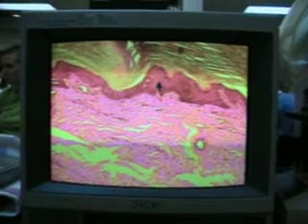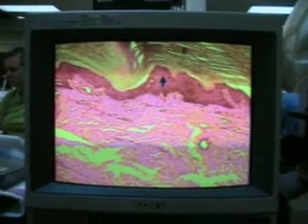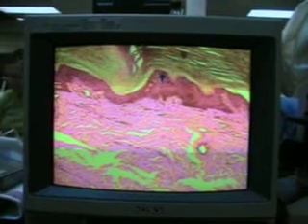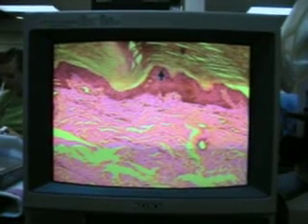And in here are the layers, the basal cell layers, the stratum spinosum layer, which is going to make up the majority of your skin. And then the very, very top layers, and I'll go to higher power in a minute, is your stratum granulosum layer, and then they become enucleated.